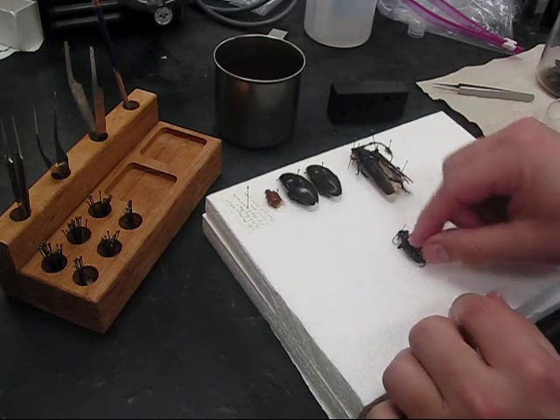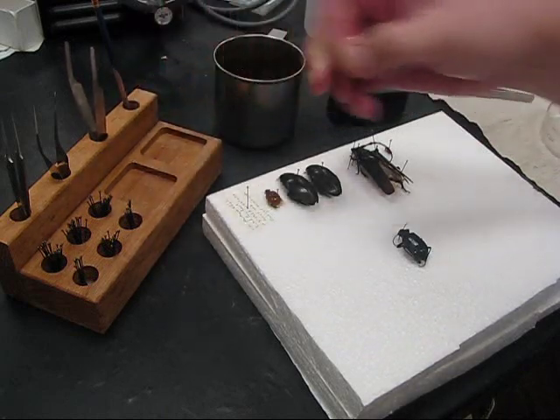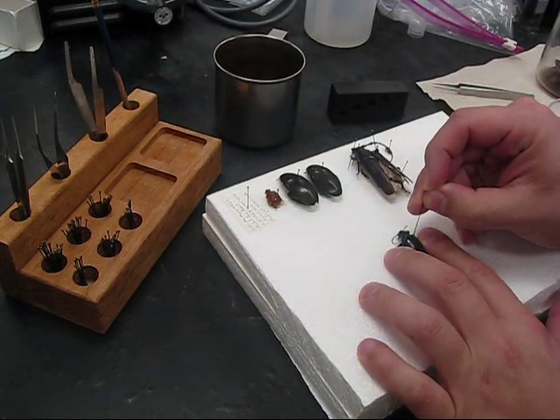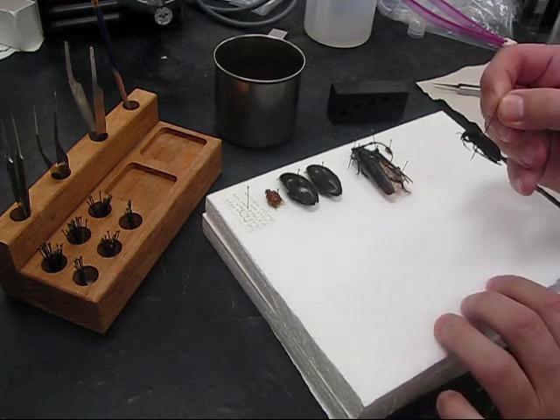It's a pretty big specimen, so I'm going to pick the appropriate size pin, which is a number 3. I'm going to steady the beetle with my fingers and then press the pin through the body, making sure that the pin is straight up and down in relation to the beetle.